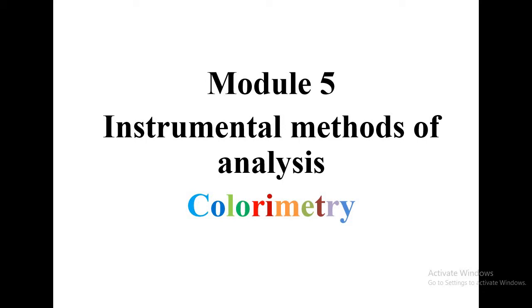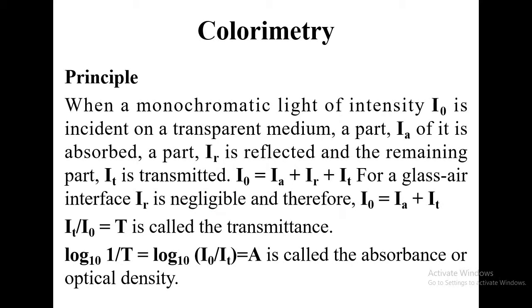Moving on from there, the first instrumental method of analysis as per the syllabus is colorimetry. Let us first study the principle of colorimetry.